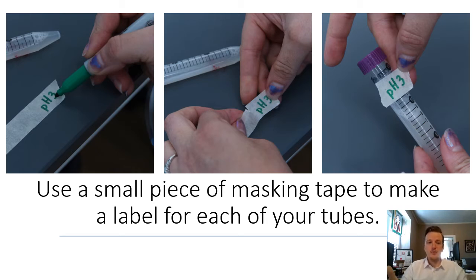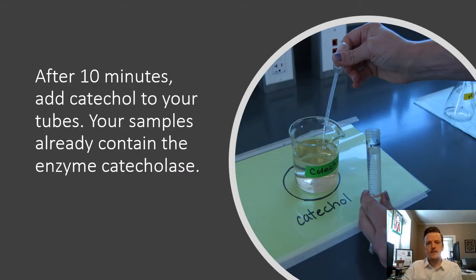Organization is going to be very important. The tubes that you see in the lab video will all be labeled with masking tape. If you write it on the vial, it can get wiped off, so it's generally better to use tape. In this case, you'll need to make sure that all of your treatments are separated. So here you see the pH 3 tube is labeled. You'll have the pH 7 and the pH 10 tubes. And yeah, just keep them organized.